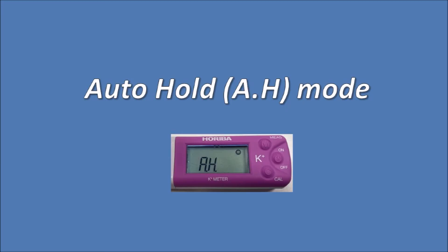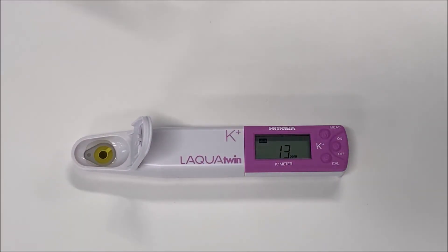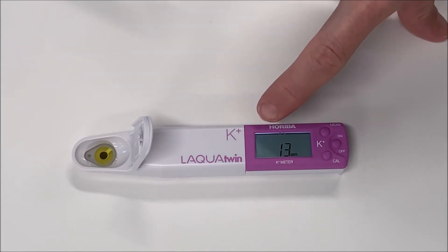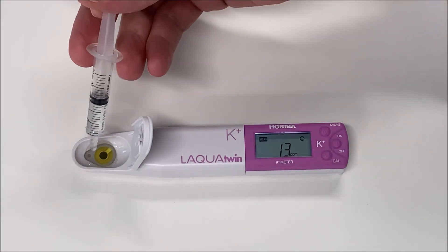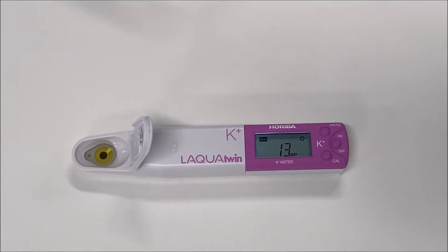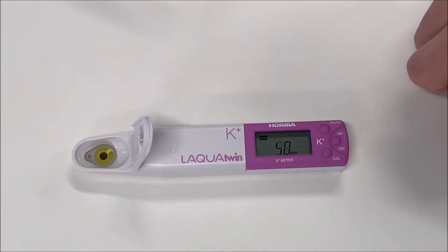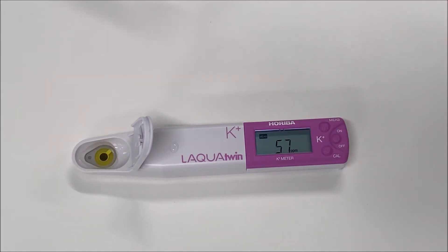Auto-Hold is shown as AH on the display. In this mode, press the measurement button to start testing. Whenever the reading becomes stable, the smiley face appears and the value displayed on the screen is frozen. Even if the value changes or the sample is replaced, the reading will remain frozen on the screen until a new measurement. To start a new measurement, press the measurement button to unfreeze the value, and press the measurement button a second time to start a new measurement.